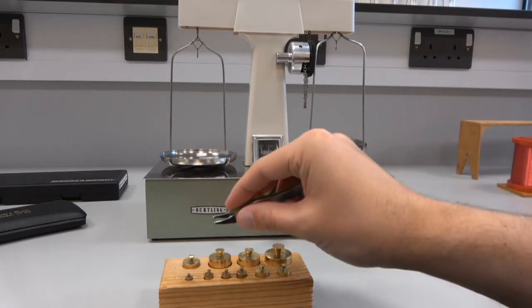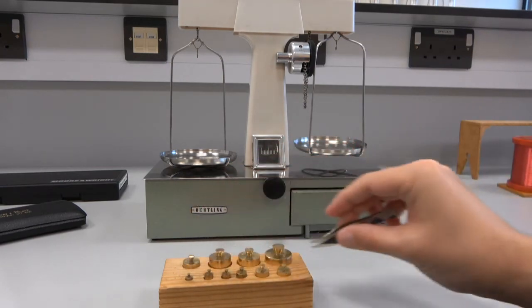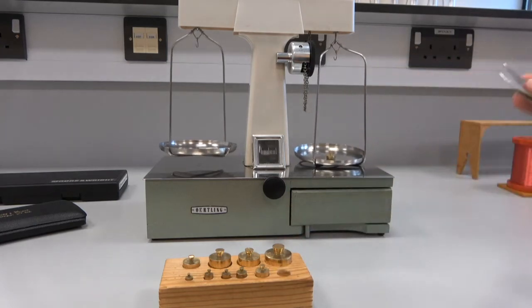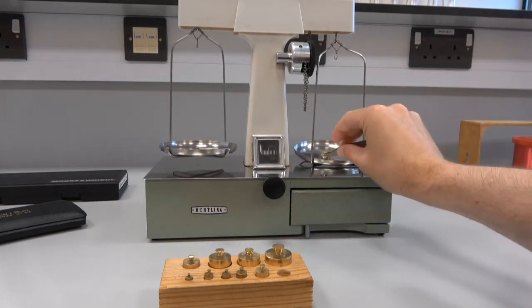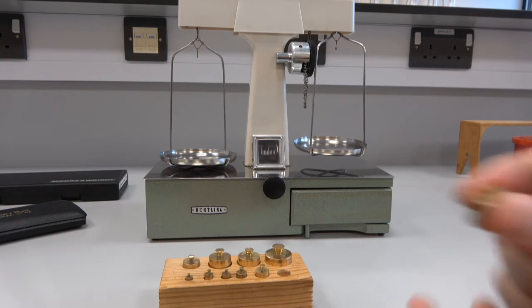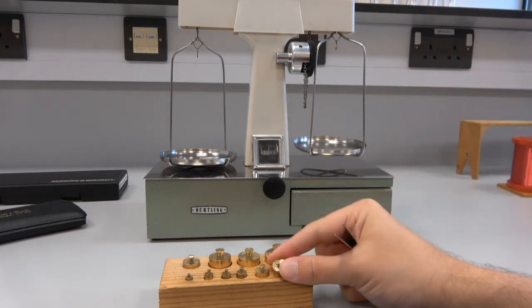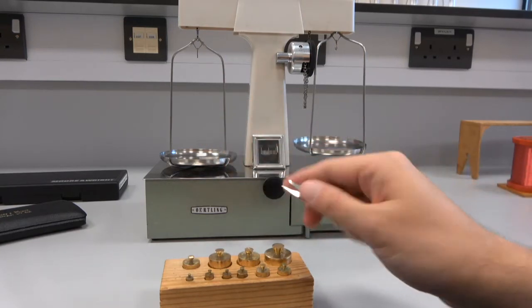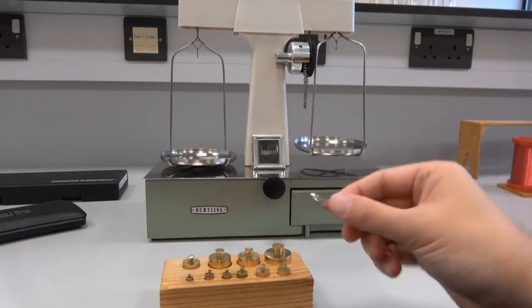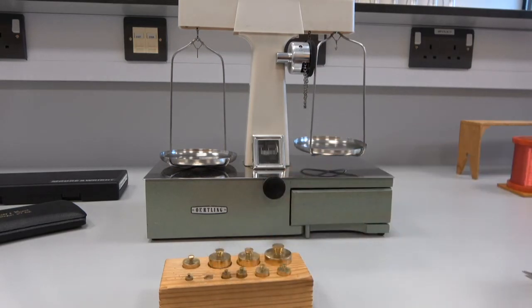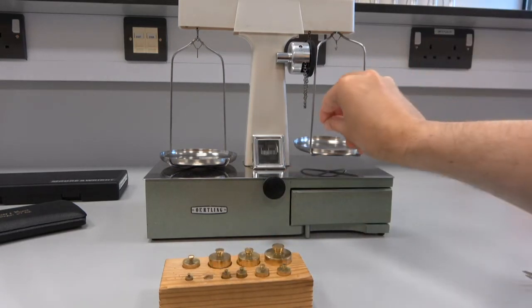So we want to take the masses. And we might start with one that's probably too heavy. So we know that this is the, I think this is a five gram, no, this is 10 grams, actually. So the 10 gram mass, that weighs less than 10 grams. I actually know roughly what the mass is, so I'm going to cut to two grams.